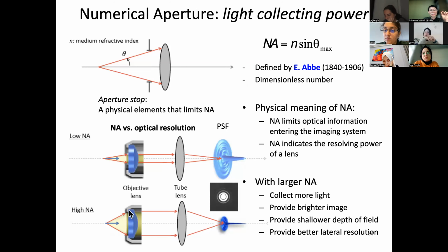If the lens sizes are different, imaging is not perfect. Point becoming point is perfect imaging, but in reality, a point will be blurred. So this is a depiction of the profile, and if you have a higher angle, you will have a sharper one. This is the real image in your photodetector.